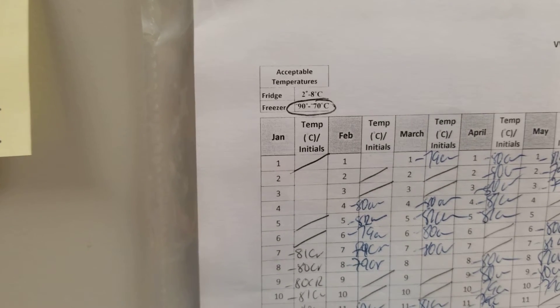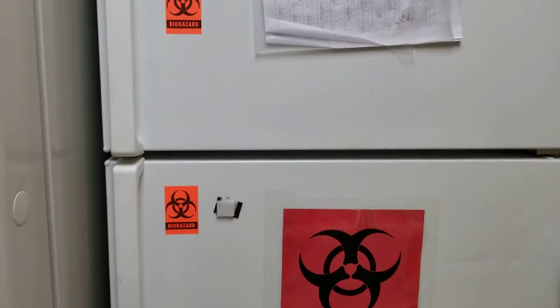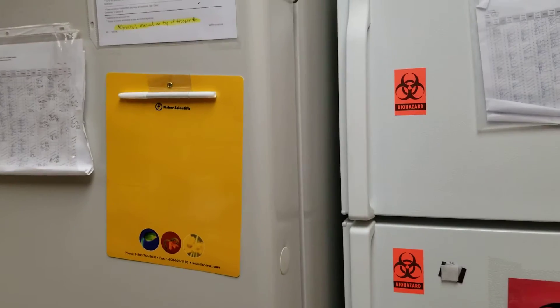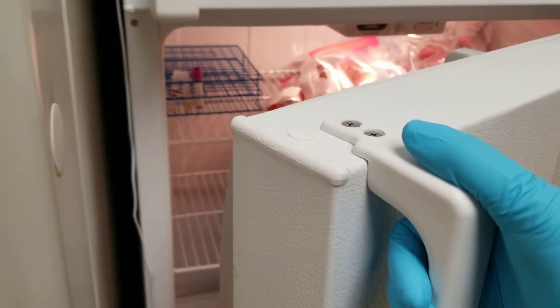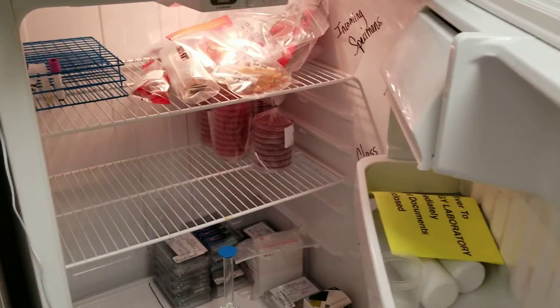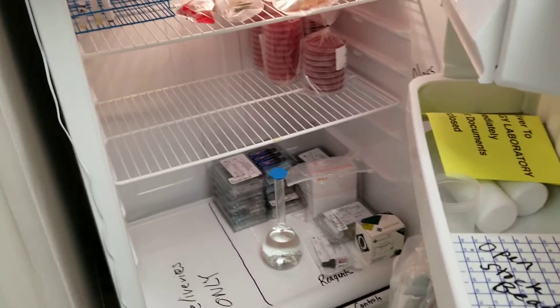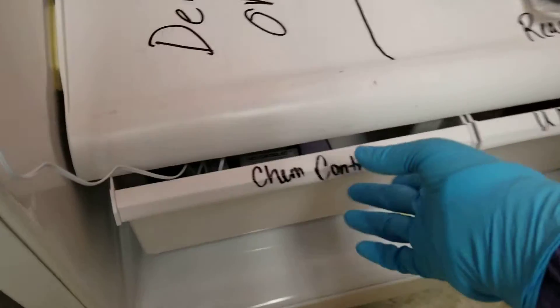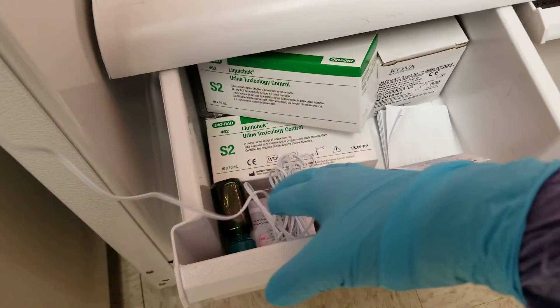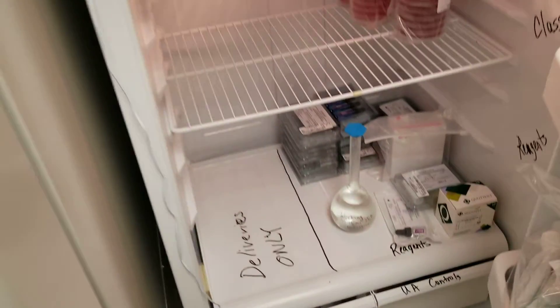Our refrigerators we're expecting to be at 2 to 8 degrees Celsius. We have a small fridge next to the large deep freezer. The small fridge holds specimens and reagents. It is labeled inside, and if you notice down at the bottom, the chemistry controls area has the sensor in it.